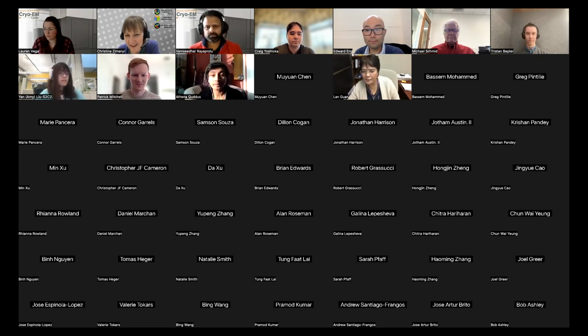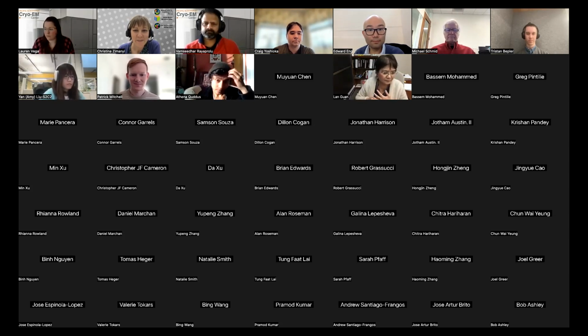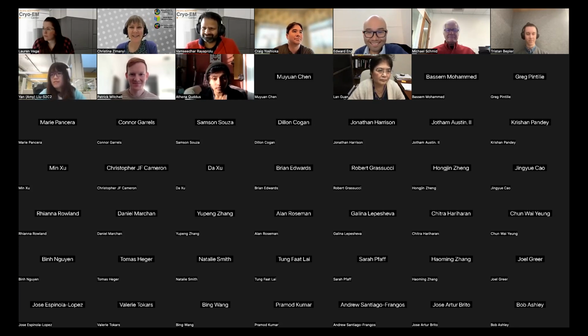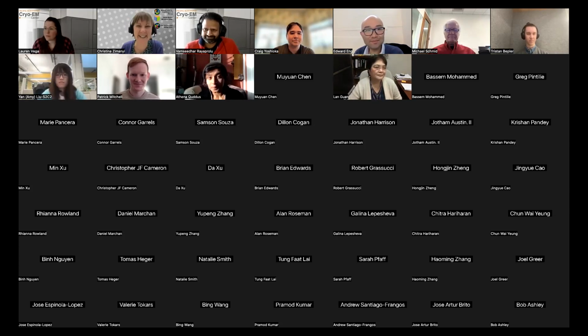Thank you. And Muyuan? Hi, I'm Muyuan Chen from S2C2. I think the only experience of particle picking is that I wrote the neural net picking in EMAN2, and subtomogram picking if that's topic 2. That's about it. That's pretty big and makes you an extremely valuable member of this conversation. So we're very pleased you're here.